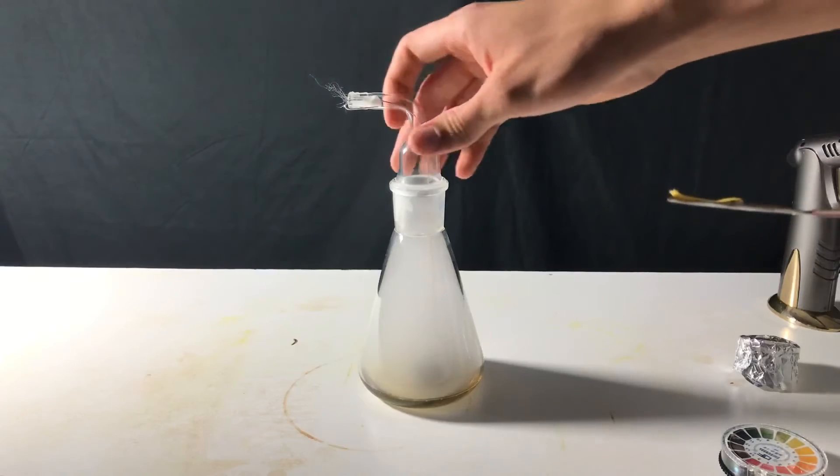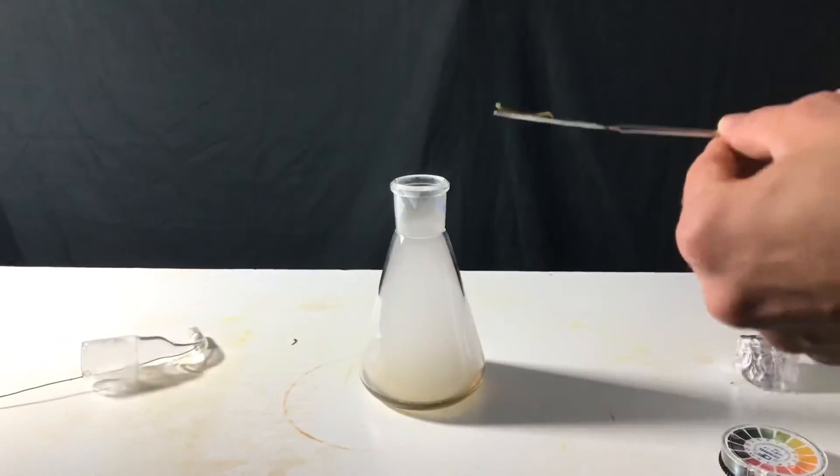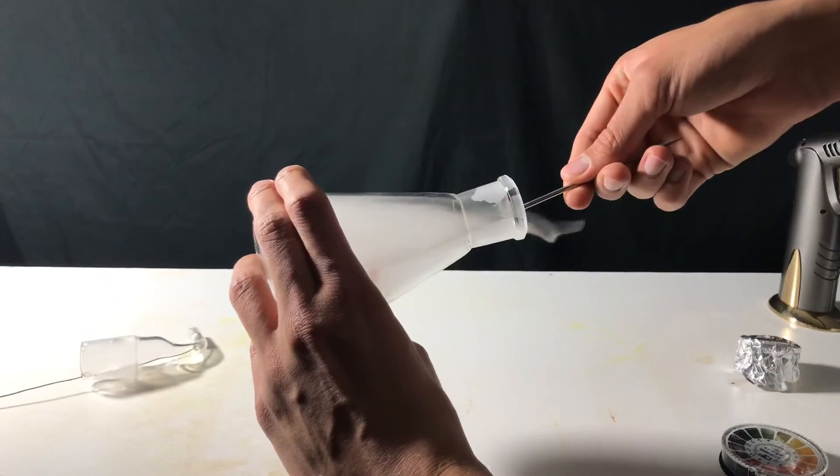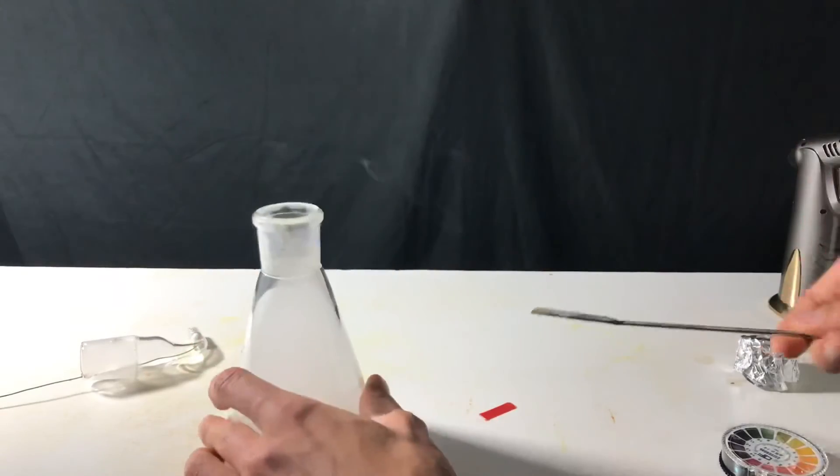The stopper was removed and a piece of pH strip was lowered down into the liquid. The pH paper turned out to be a bright red color which indicates the presence of acid.